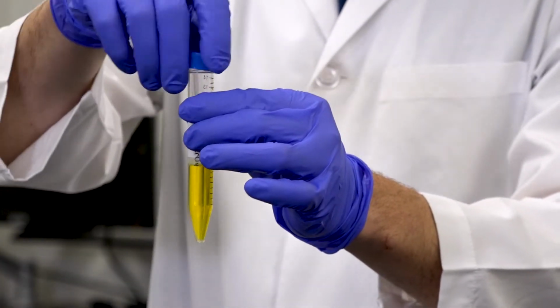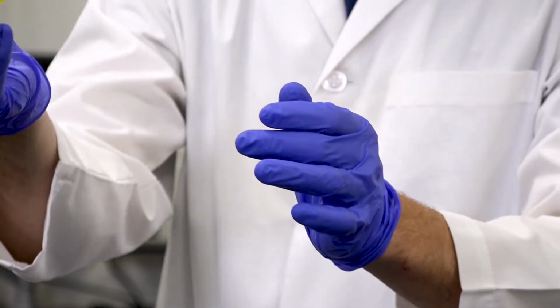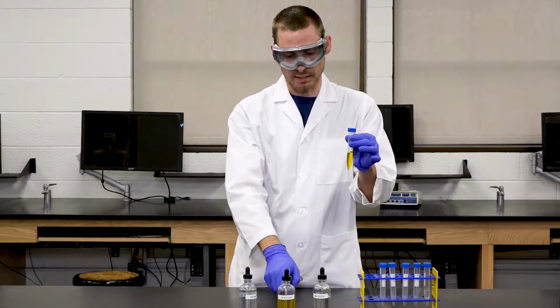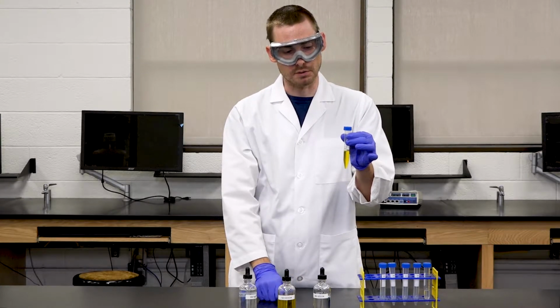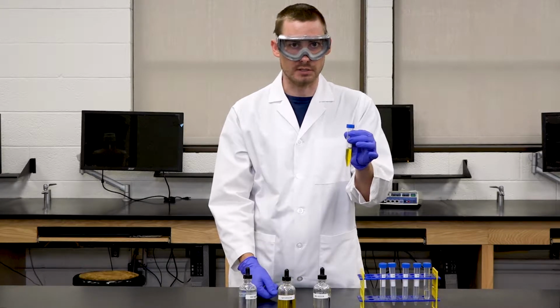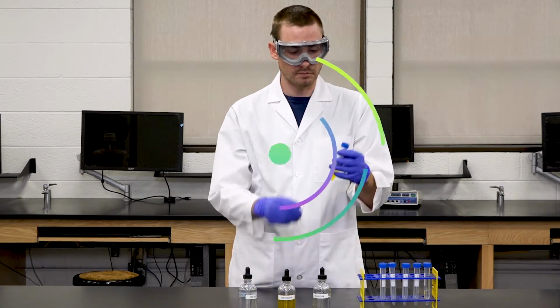So now that it's back to being yellow in color, you can see that we have the chromate ion completely. So we've now gone back to the reactants like in the original solution. You can continue to go back and forth until it's too concentrated to see the color changes easily.